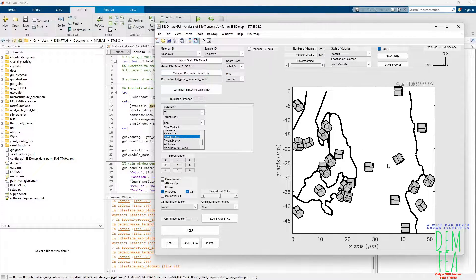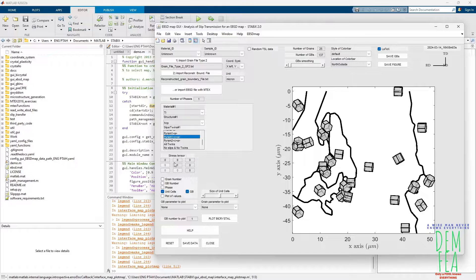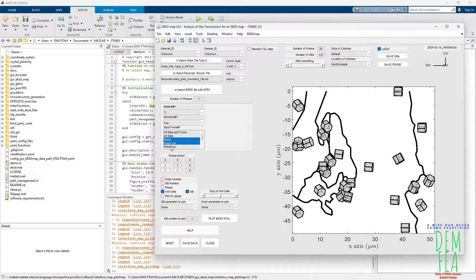You can see the HCP crystals over here. Please remember to put the correct stress tensor, otherwise you will get the wrong results. In this case, we are going to do the slip trace analysis for the following: basal slip, prismatic slip, pyramidal slip, pyramidal 1, and pyramidal 2.